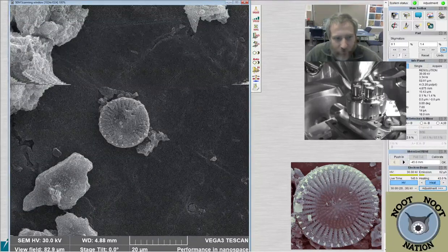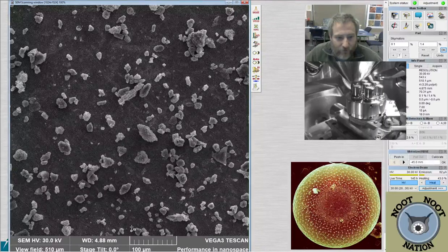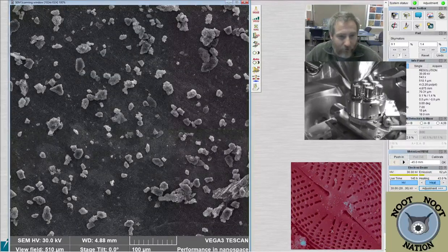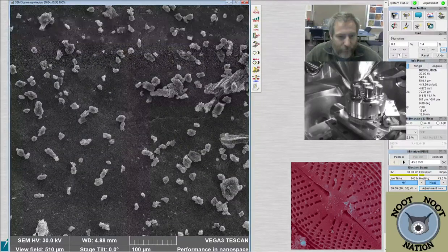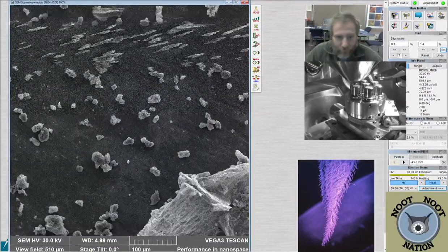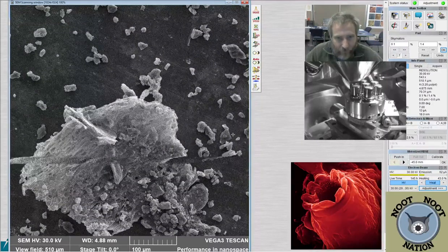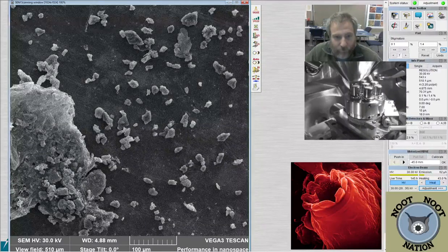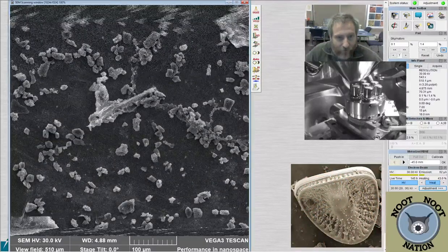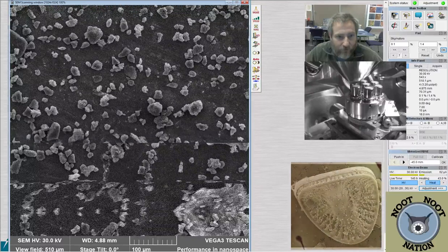Again, there's another meneghiniana. It's just covered with clay. So, thwarted once again by clay. For these samples, we tried to reduce the clay by rinsing them. So we shake up the sample and allow it to settle a little bit and then vacuum off the water while the clay is still suspended. So we're using Stokes' law in our favor. Little particles like clay and tiny bits of the silt will still be in suspension because they will settle through the water column a little bit more slowly because their surface area to volume is higher, so they have more friction as they move through the water and they settle more slowly as a result, and they'll stay suspended.